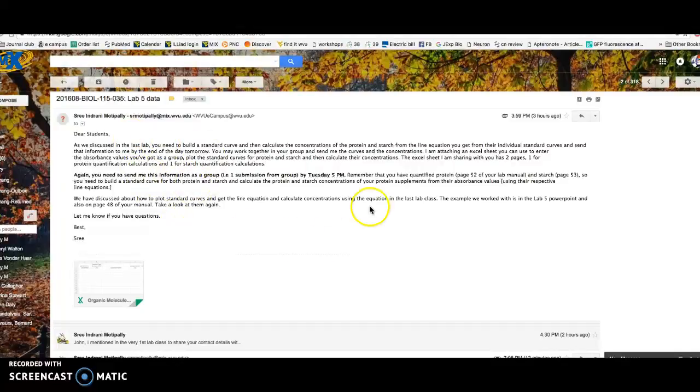I guess you got this email I've sent you asking you to plot a standard curve for both protein and starch values you got last lab, and then calculate the concentrations of protein and starch. So doing this literally takes maybe like half an hour. So I'm making this video for people who are a little bit confused about where to plug in the values you got and stuff like that.